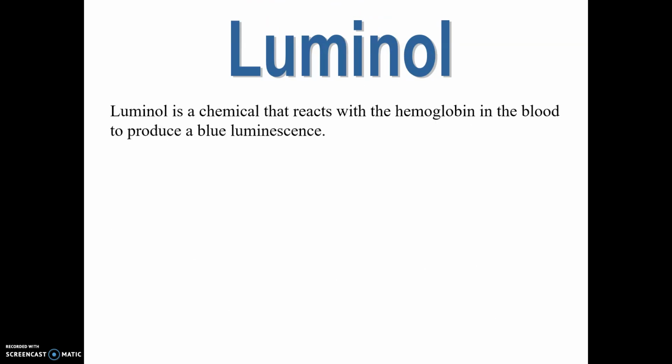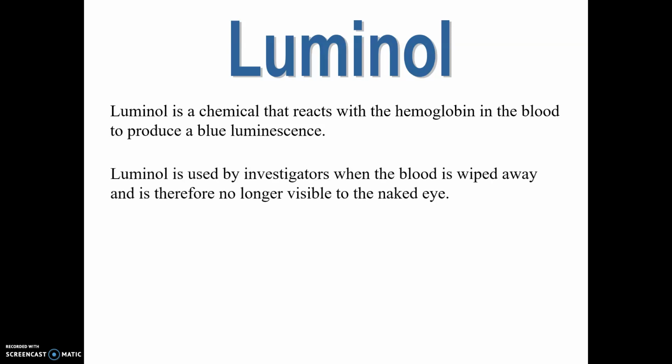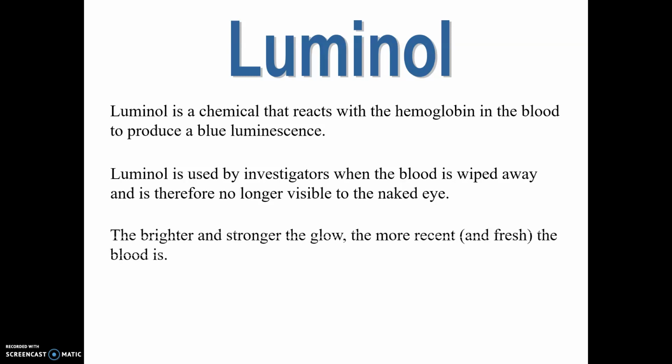Okay, so the one I wanted to just call your attention to a little bit further is just luminol. So luminol is a chemical that reacts with hemoglobin in the blood to produce a blue luminescence. Luminescence is kind of the quality of, let's just say, fireflies, right? Fireflies glow because of a luminescent chemical in their body. Luminol is the same thing. So luminol is going to be used by investigators when the blood is wiped away and is therefore no longer visible by the naked eye.